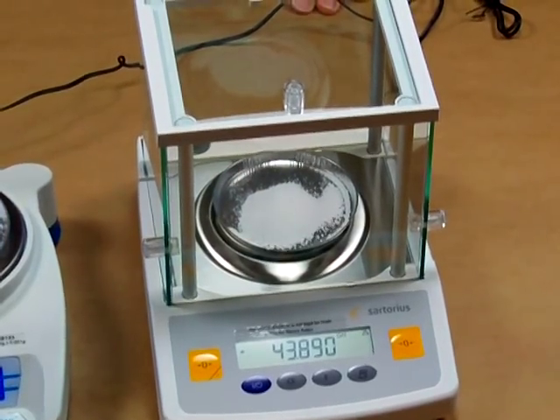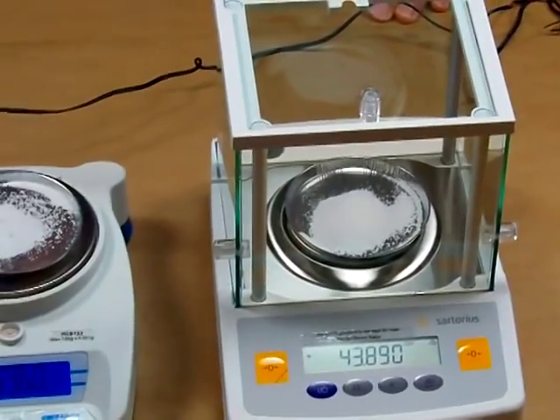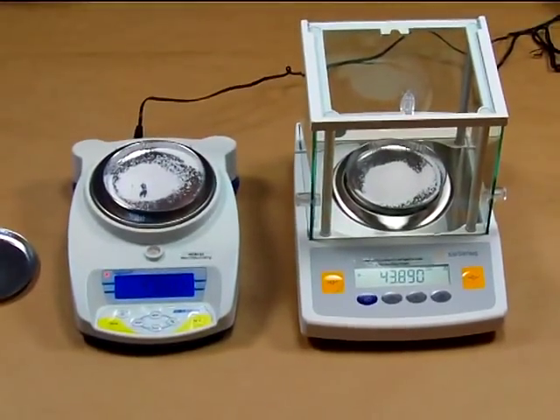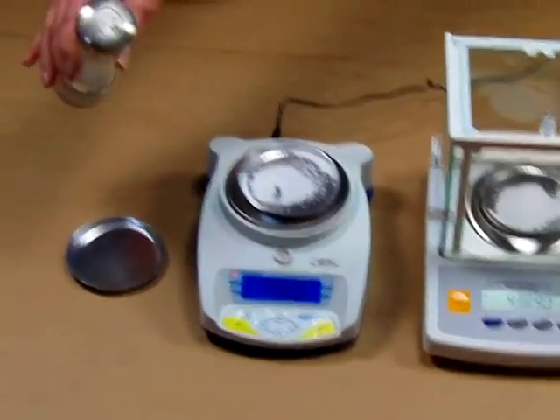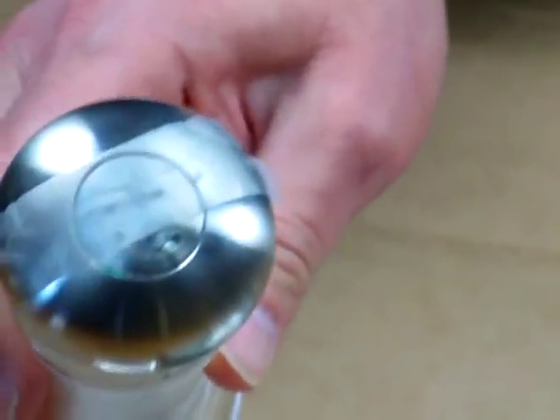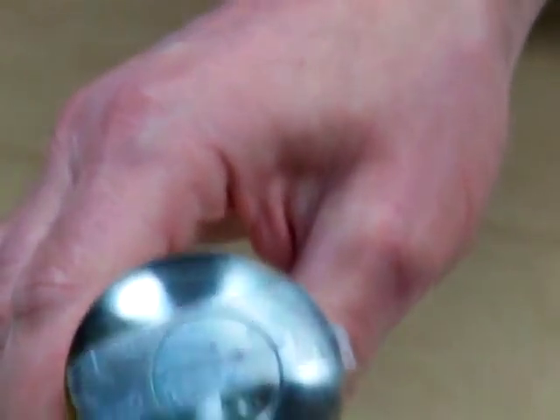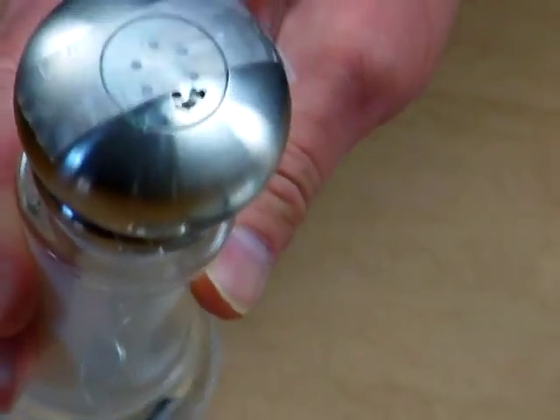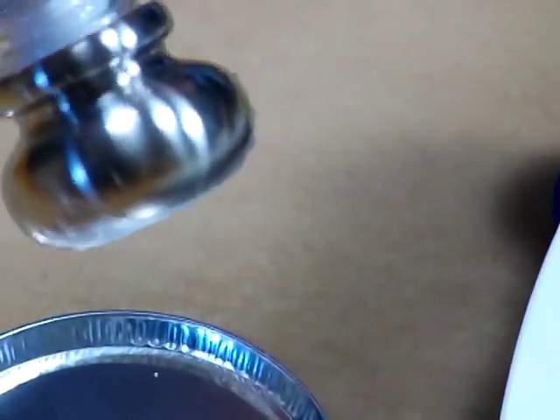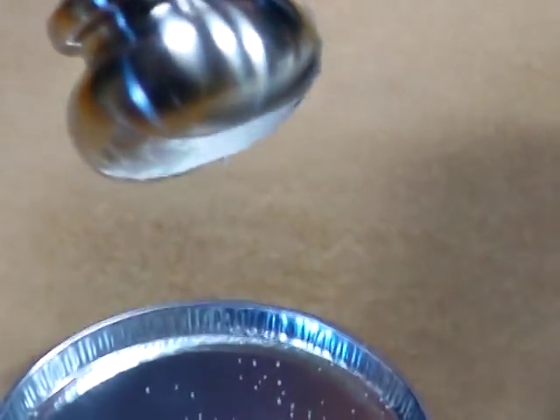What we're really trying to show in this demonstration is the difference in performance — where you see the weight change. I have a standard salt shaker where I've put scotch tape over all the holes except one. I'm going to add salt slowly to the weighing pan and sprinkle it on so you have an idea of how the salt is coming out.